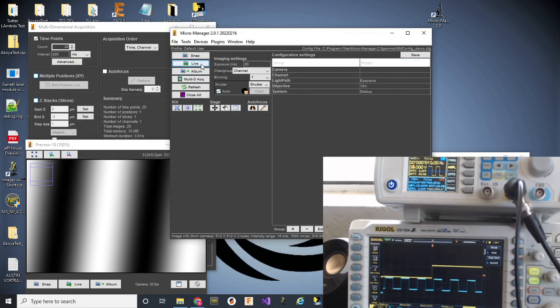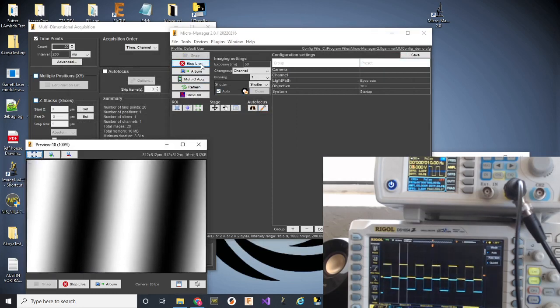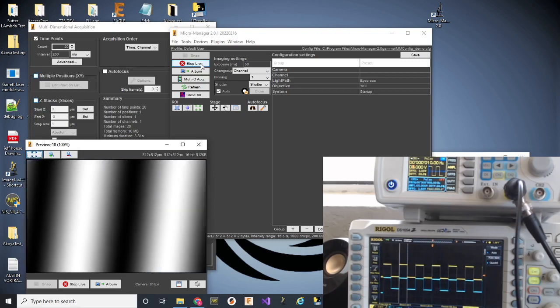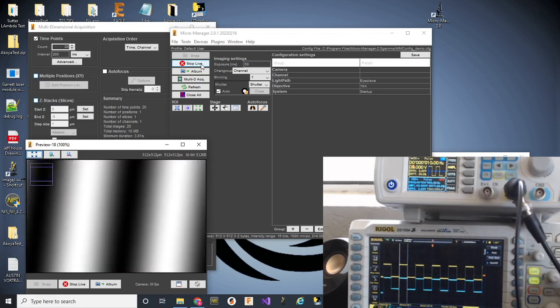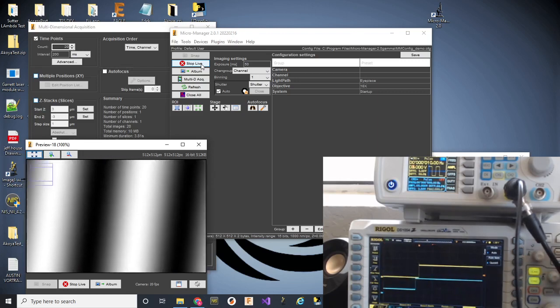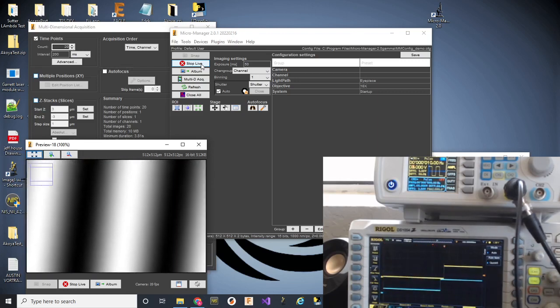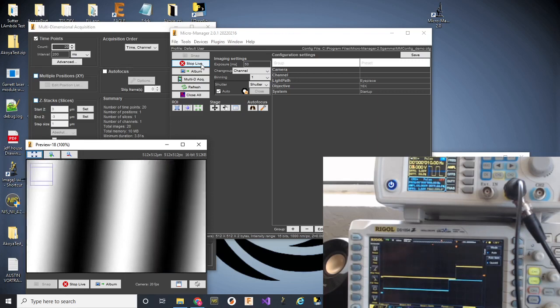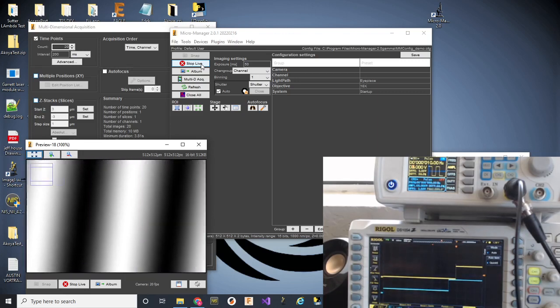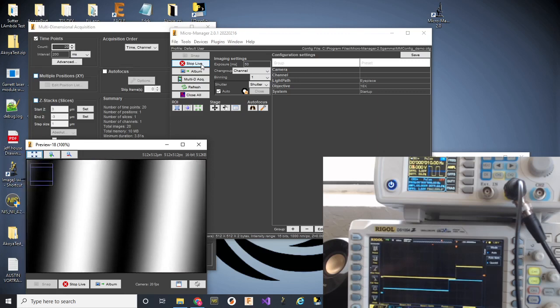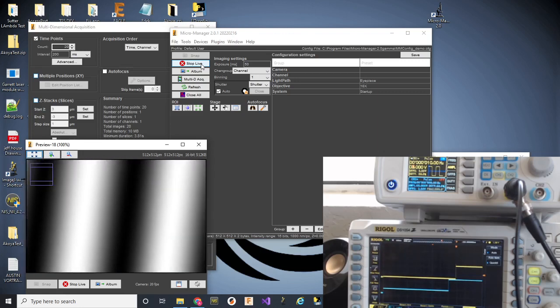So, now, if I go live, what I can see is that the blanking directly follows that blue line input. And this is relatively fast. This is going to be less than 100 microseconds or about a tenth of a millisecond. I'll zoom in just to show that. The grid pattern on the oscilloscope is set to 100 microseconds per division. And you can see that we've got about a 90 microsecond delay, but it's nice and consistent. So, that's exactly what we want. And the output's only going to go high when that input goes high.